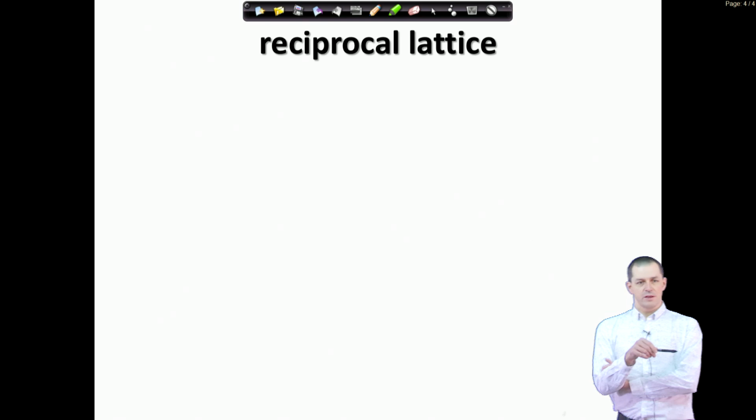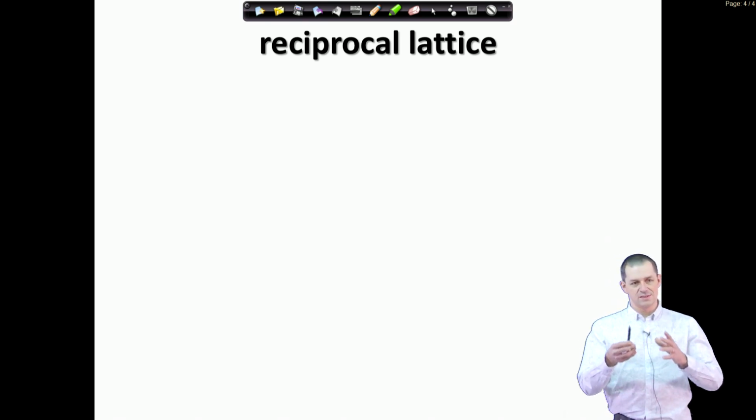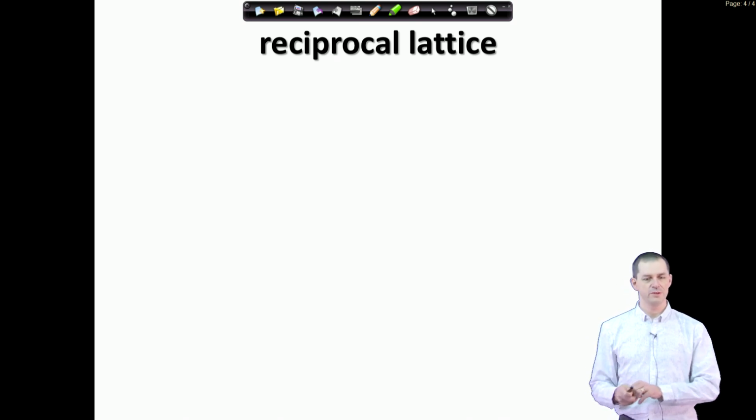So far I spoke about crystal structures as objects without considering anything about how we determine them. I described their symmetry, I described the lattices, but I didn't speak about the way to figure out what these things are. And of course, you know that the means of learning or determining crystal structures is diffraction.